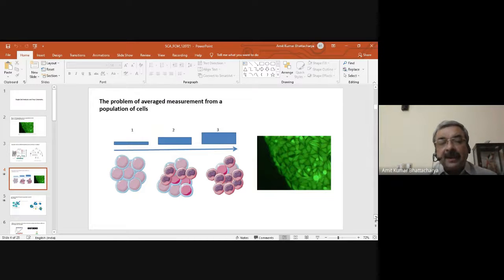So this is again conveying the same picture. Let's say we have some cells which are growing in time, multiplying in time, and as they multiply, you find that you have one level of protein. There's a particular protein present in all the cells at a particular quantity, and this quantity is reflected in the peak that you see here.